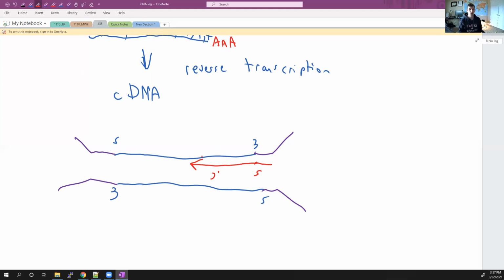Most of the time it's shorter than 1,000 bases. Sometimes more, sometimes less, but on average it's about 1,000 bases. Illumina is to the point where we can get 300 bases out of a sequencing run, so we can sequence this strand inwards for about 300 bases before it stops. It's not as efficient.